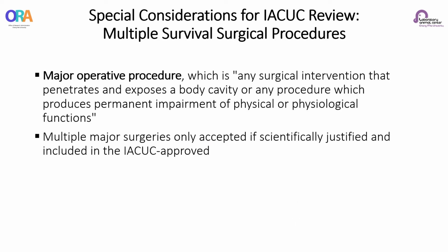The next special consideration is multiple survival surgical procedures. Multiple major survival surgery on one animal is only acceptable if it has been scientifically justified and included in the IACUC-approved protocol. This applies to all animals covered by the guide, and it is important. Cost saving alone does not justify multiple major surgical procedures. It is not reasonable.